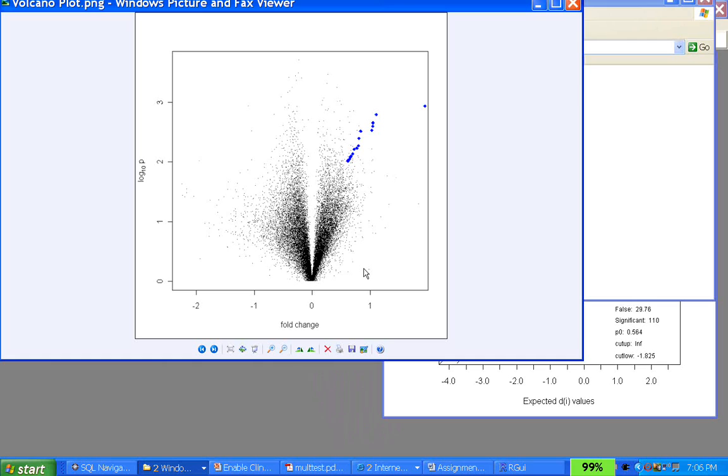But in our homework, you did not have any replicate. Each cell file belonged to its own condition. So group by should have been false. But anyway, I think I corrected that in the solution that I posted. It was a little difficult in how you were going from expression set to a data frame and extracting the t value, p value.